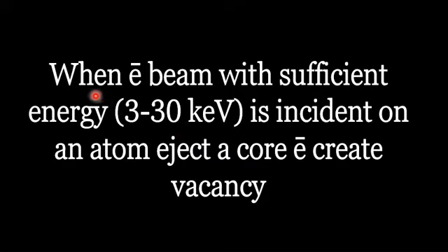So when an electron beam with sufficient energy is incident on an atom, it ejects a core electron and creates a vacancy.